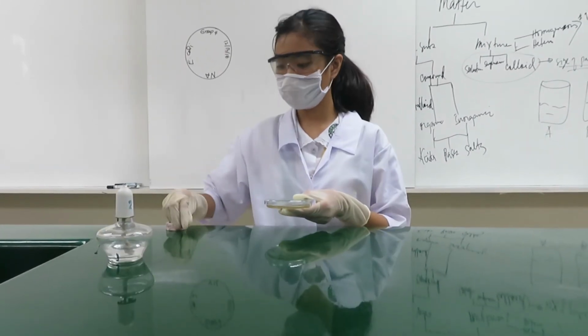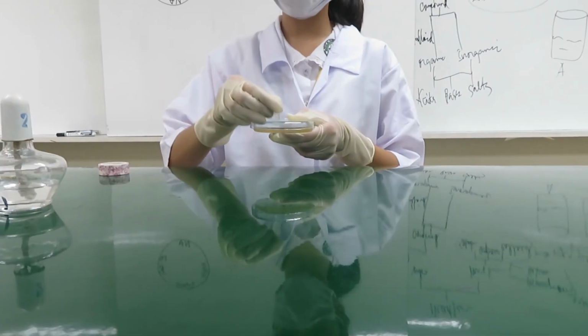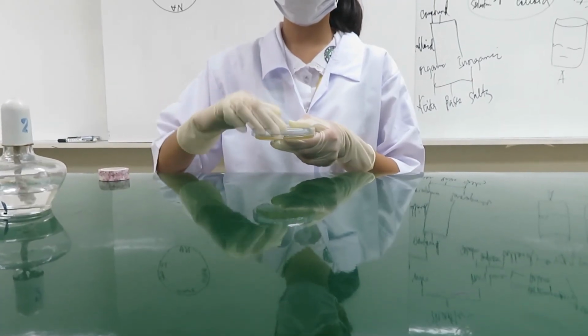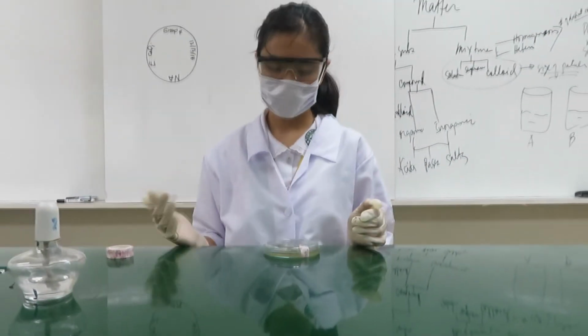7. Incubate the plate upside down so that the condensation of the lid will not fall into the colonies. Also, don't forget to use 2 strips of tape to seal the petri dish, and that's it.